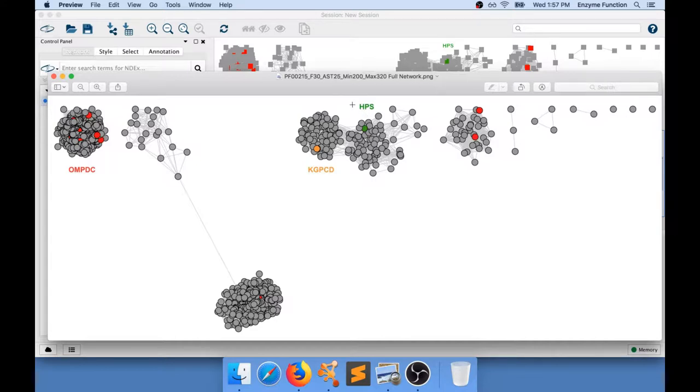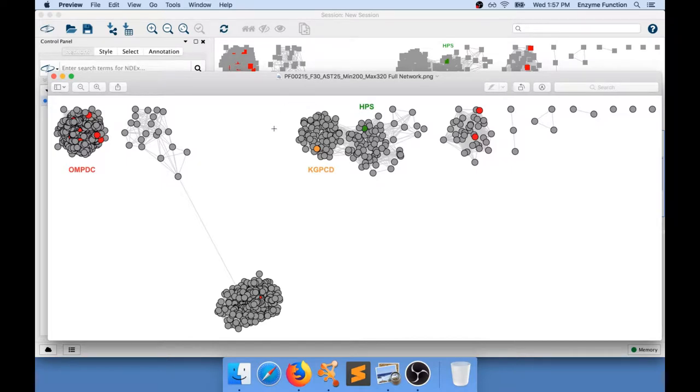So this particular cluster of sequences is interesting because it has two different sub-clusters that seem to appear, this one and also this one, and we can clearly see that we have two different types of SwissProt annotations within this same cluster.